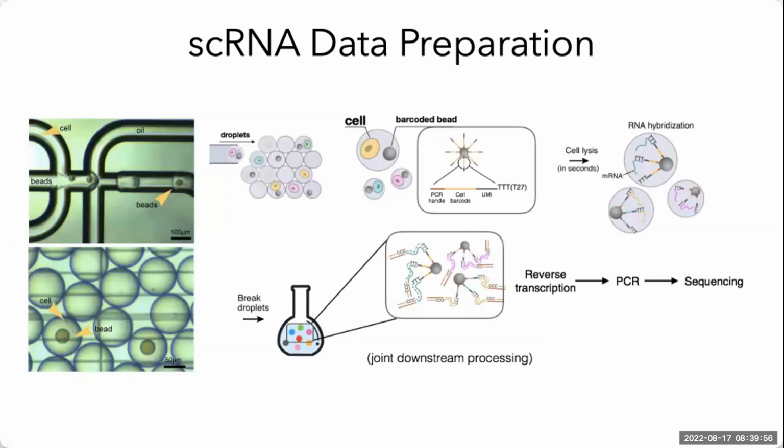But in contrast, when we use tag-based protocols, we only capture either the 5' end or the 3' end of each RNA. The choice of quantification method has extremely important implications for what types of analysis the data can be used for. In principle, a full-length protocol should provide an even coverage of transcripts, and we shall see that there are often biases in these coverages.